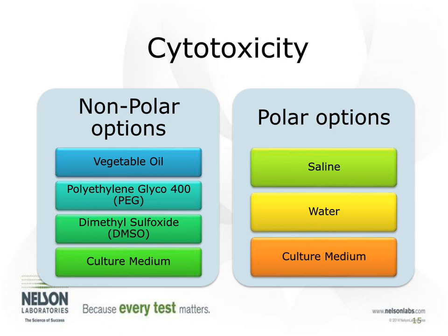And just like our body, we have oil and we have adipose or fat tissue that is more nonpolar, and we have other portions of our bodies that are more polar. So the devices will see both a polar and nonpolar atmosphere in the body. And so it will pull off chemicals that are polar and nonpolar. But our extracts have to mimic that. We have to extract in the nonpolar and polar.